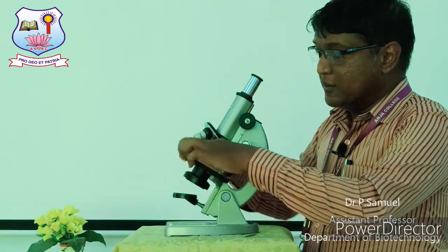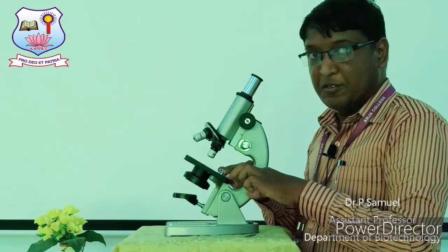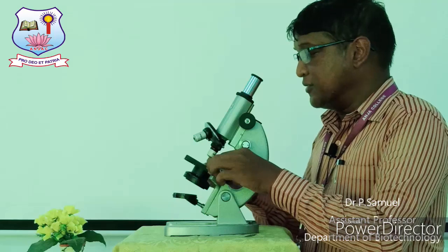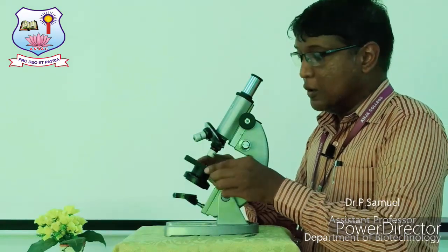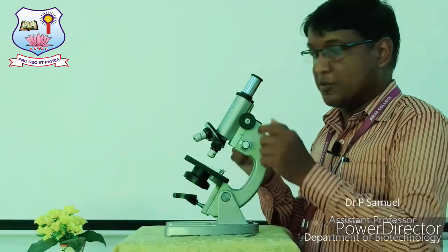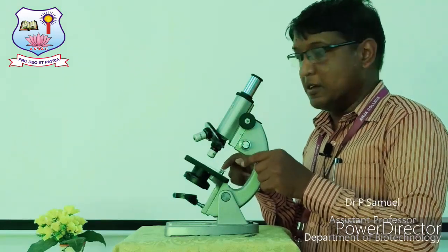And above the diaphragm, this is called a platform for mounting your specimen. On either side of the platform or working stage there are two clips, which are used to hold the slide tightly, because while observing the specimen the slide should be in its place, otherwise it is very difficult to visualize the image at the right position.